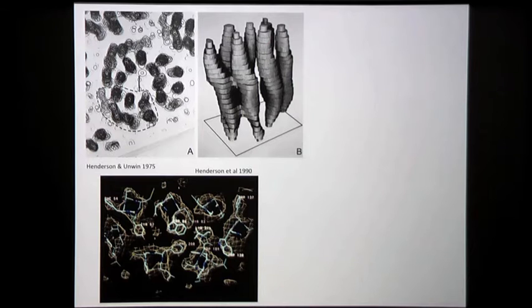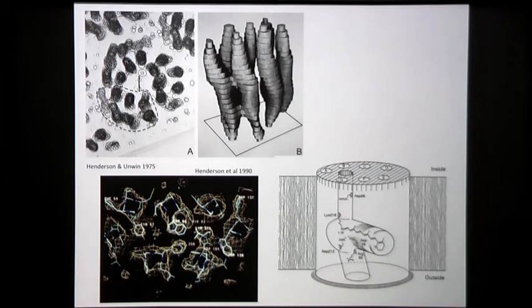And they took this to the stage of essentially having a crystallographically refined map from which they could hypothesize a mechanism for the light-activated transport of protons. So this shows you that, once you get to high quasi-atomic resolution, as in protein crystallography, then you can start saying something interesting about the biological function. And that's why we need to get to high resolution.